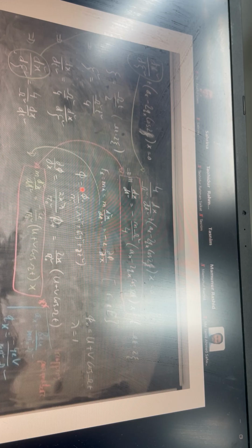The step-by-step calculation is available in my PhD thesis. I'm just showing how we can solve the math equation for the quadrupole, but I'm not actually teaching you core mass spec here.